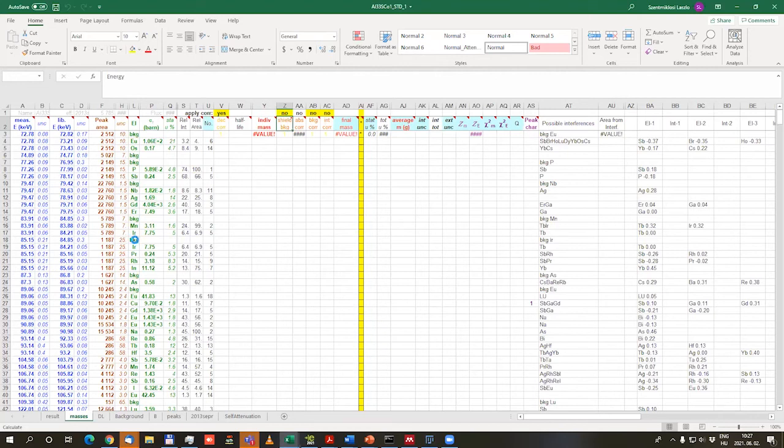So one element can have an analytical line where another element has its own, other line. And if they are too close to each other, it is impossible to resolve them by fitting. So in this case, we apply a numerical subtraction of the contribution of the interference, and the leftover will be assigned to another element.